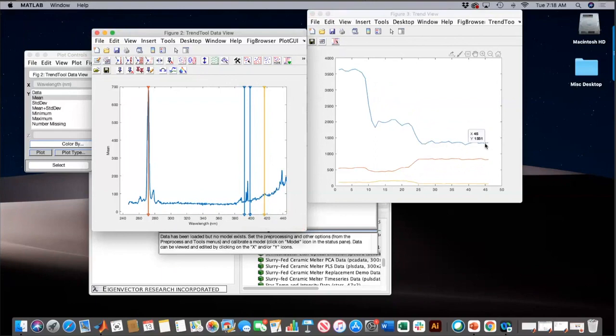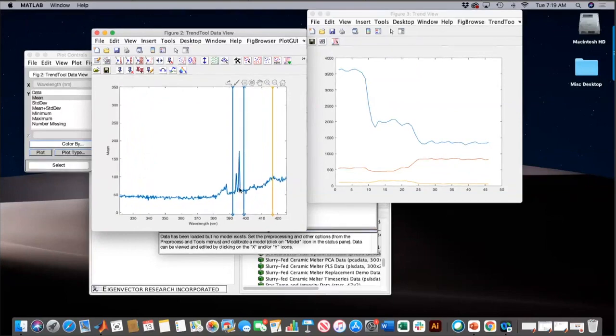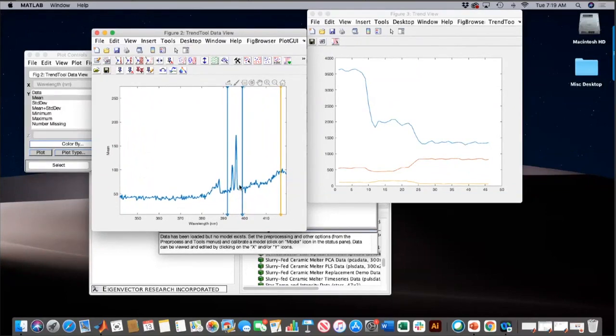Well, part of my problem here is that I've got baseline on this, because even when I'm all done selecting my area here, and I know I don't have any aluminum out in this region when I've etched everything off, I've got a big background. So one of the things that we can do, and I'm going to zoom in a bit here, I'm just using the roller top surface on my mouse, is take this and do a control click and say add a reference.